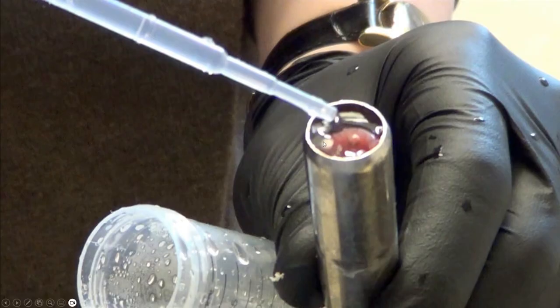Usually 1.65%, the same agar concentration that you use to inflate the tissue, is sufficient for the exterior of the lung piece that you insert into the pedestal.